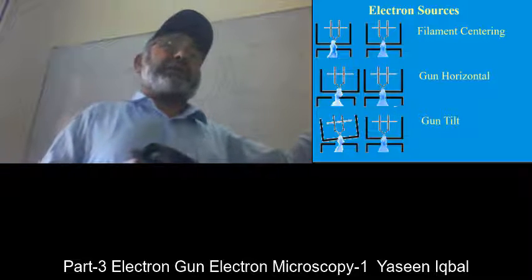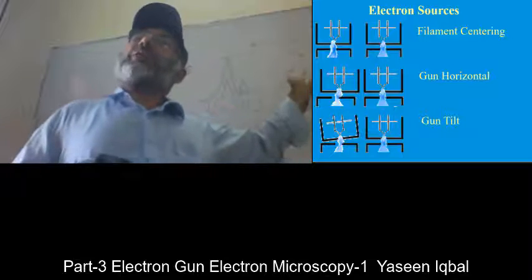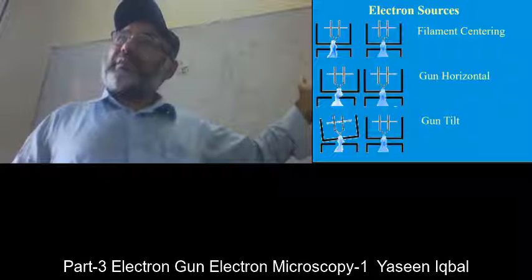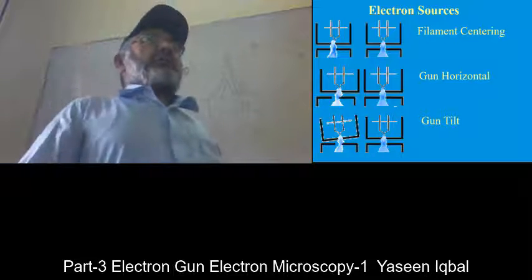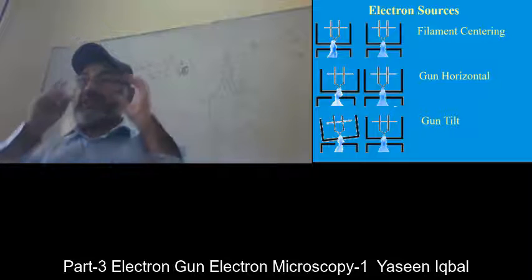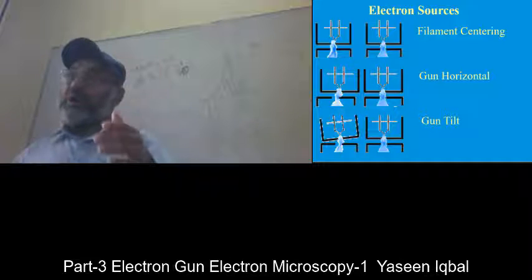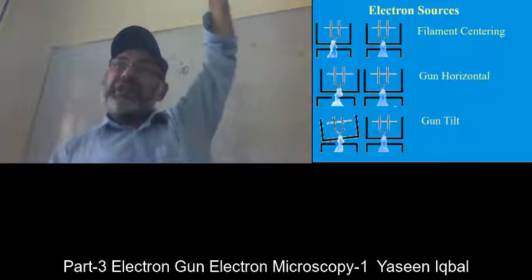When your source of light is not under your control, how can you control the beam from there? So the machine is made for specific conditions, for specific orientation, for specific focusing from A to Z, from the electron gun to the screen.